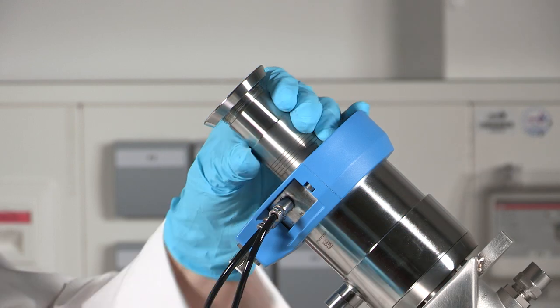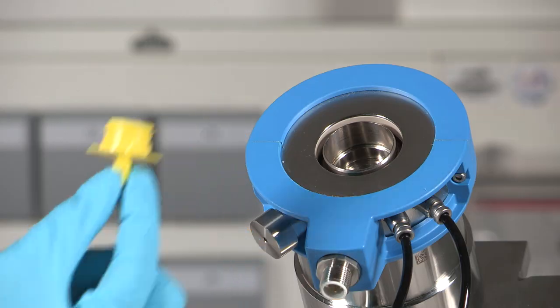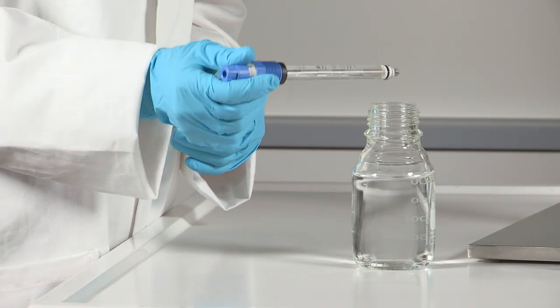Unscrew the retraction pipe. Remove the yellow protection cap. Shortly immerse the sensor shaft in water for easier installation.